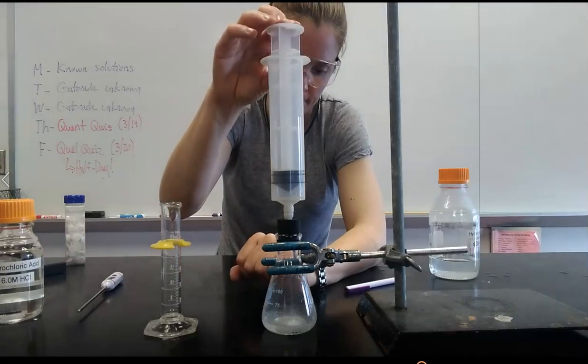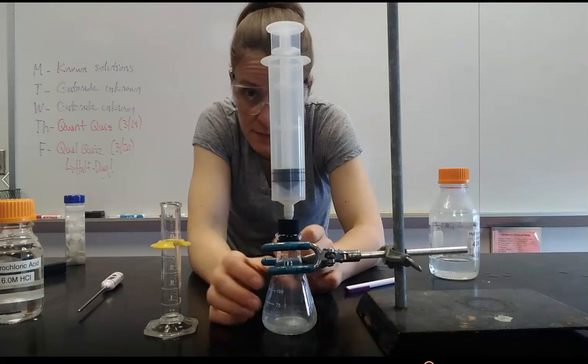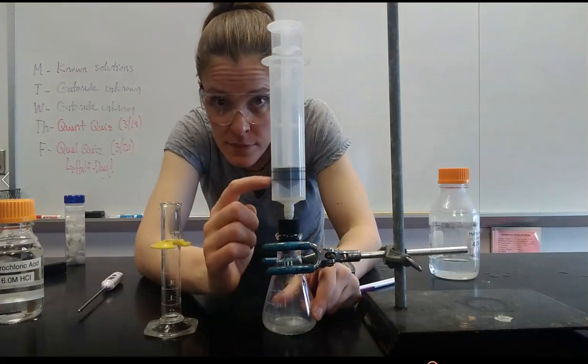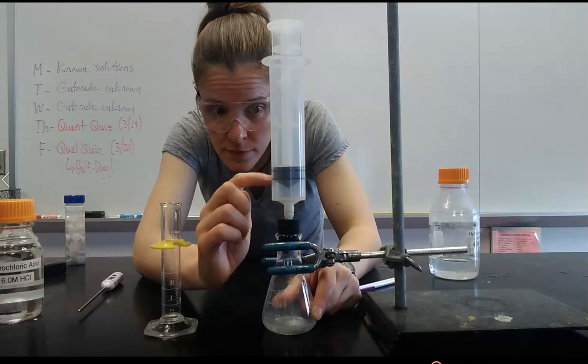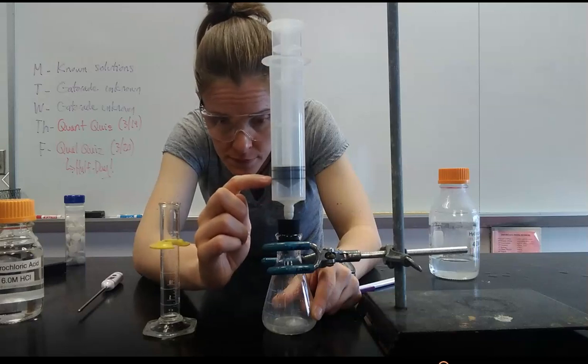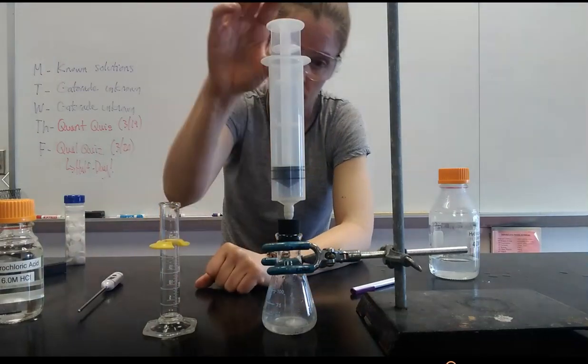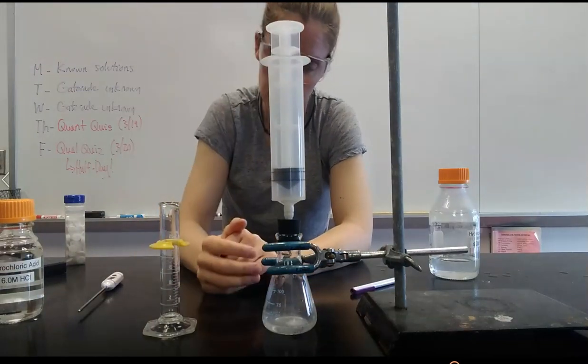10 second mark, push down. 15 second mark, record. When you record you don't want to measure where the tip of the plunger is. You want to measure from where the plunger is in contact with the barrel of the syringe. That's that idea.